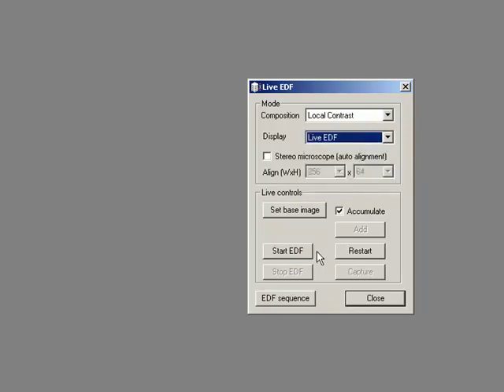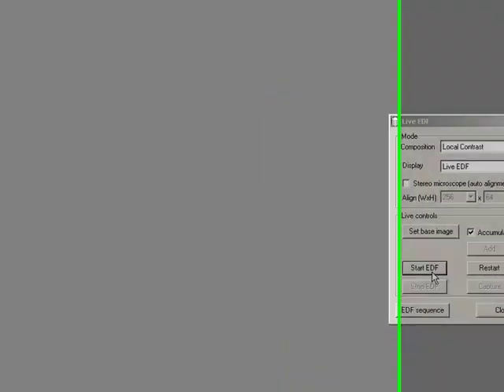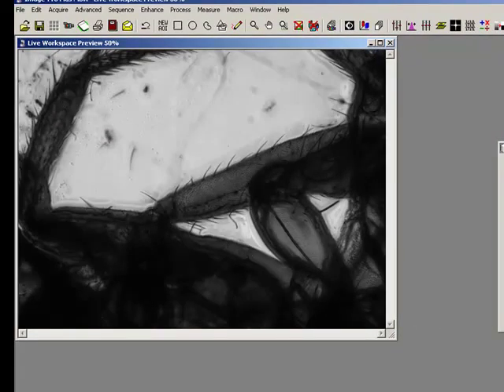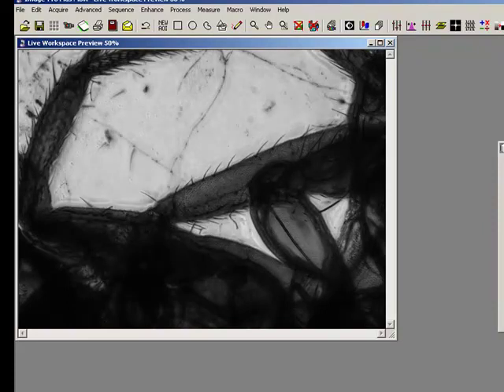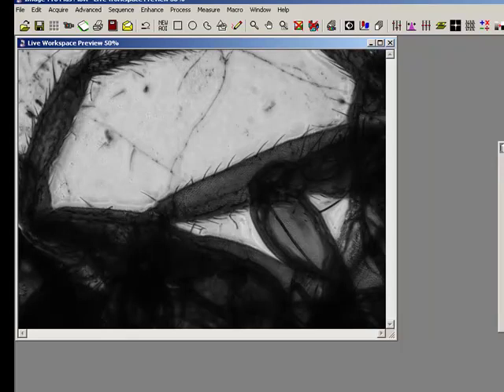All I do now is say Start EDF, which is now my image. As I go down through my focus, you can see as I go along I just add in what's in focus.